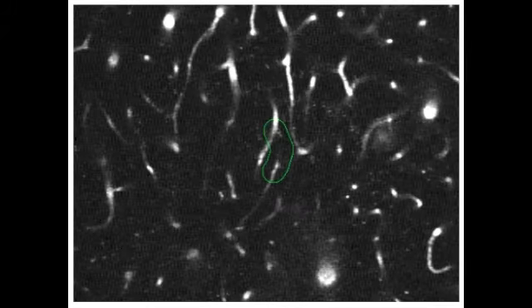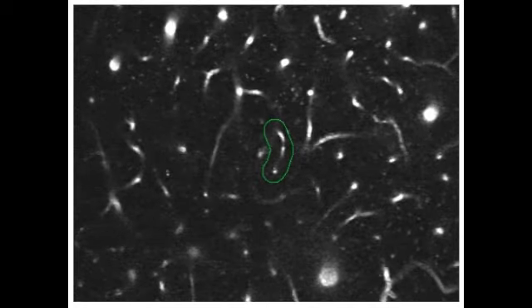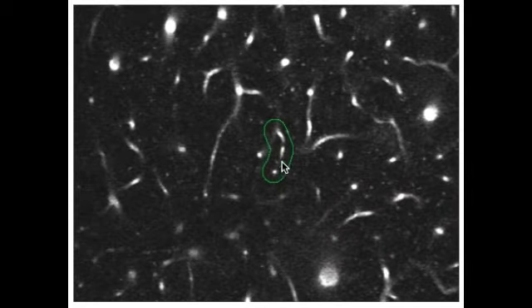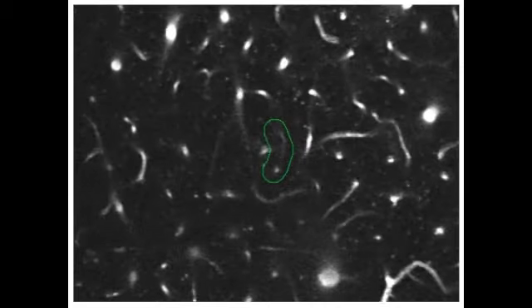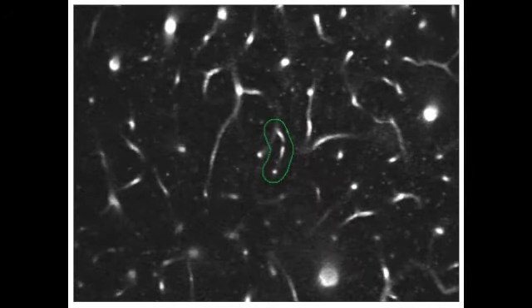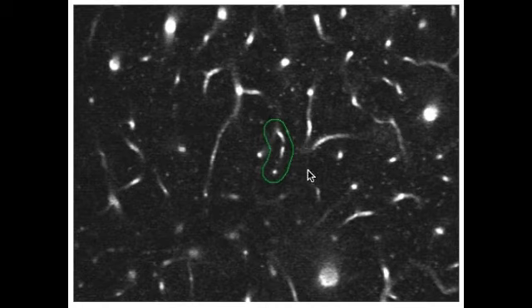This particular vessel has an interesting feature: a dark area here that never fills in all the way. That's considered a stall, because throughout the entire image, as we move the slider back and forth, that area never gets filled in by the white vessel fluid. Something is blocking the white fluid from moving through — a blood cell that's stuck in the vessel. So we'll click Stalled and click right on the spot where we think there's a stall.